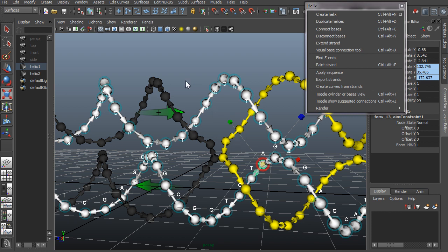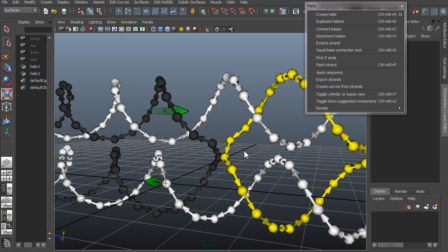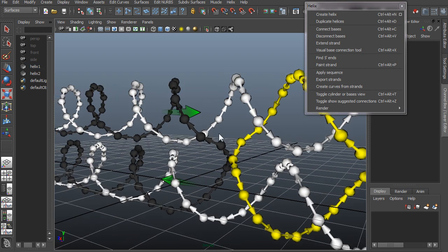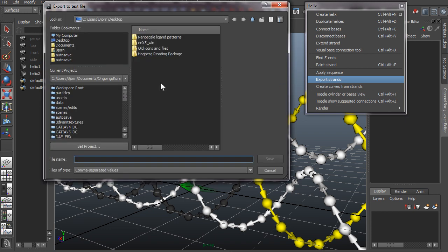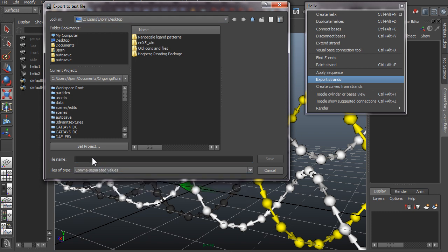If we want to export this into something like an Excel file, you take export strands and then let's save this on the desktop. Let's save it as a comma separated value file, strands.csv.